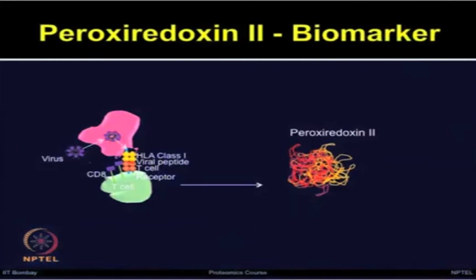So, among the various proteins identified in this study, peroxiredoxin 2 appeared quite interesting, also because it was validated by independent techniques. The level of plasma peroxiredoxin 2 in patients with SARS was significantly high. Proteomic analysis and Western blot validation suggested that peroxiredoxin 2 may be used as one of the SARS disease associated biomarkers.